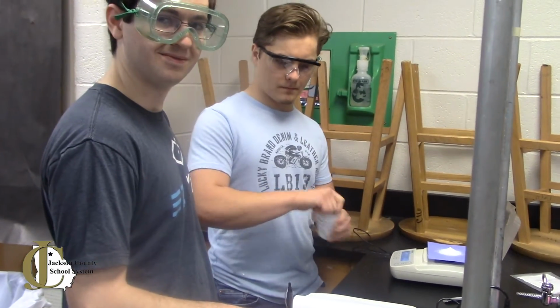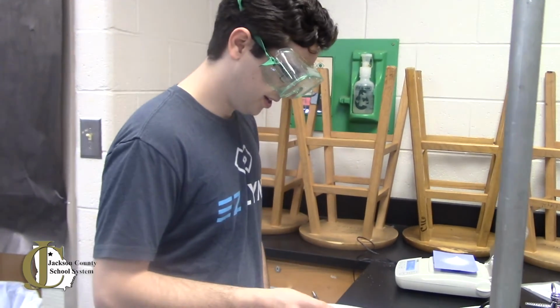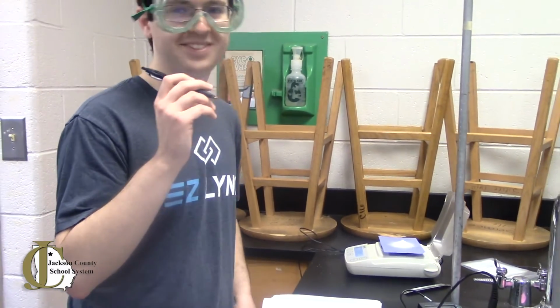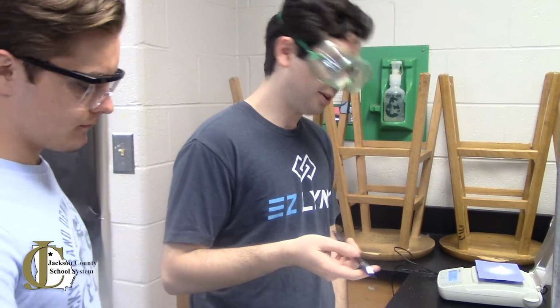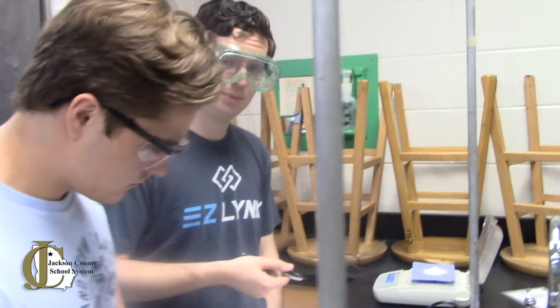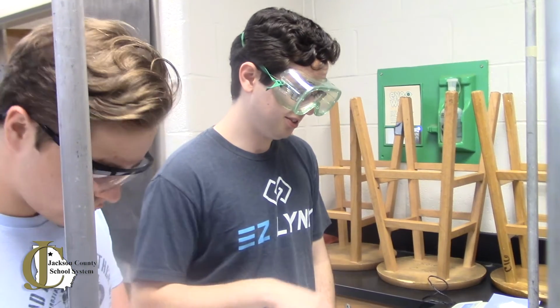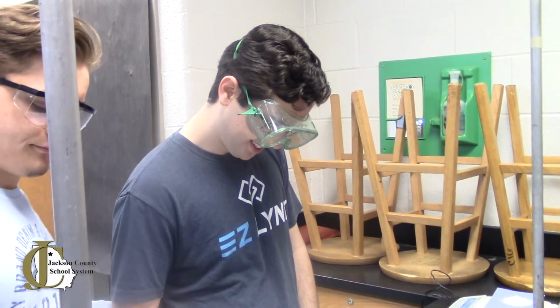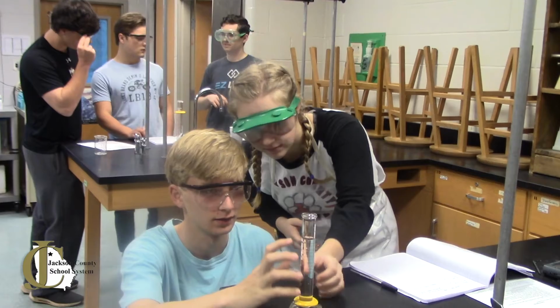Which chemical are you using? Currently we're using Na2S2O3, sodium thiosulfate. We're a bit surprised, as we expected the salt to be endothermic in the reaction, but it turns out to be exothermic. That's a surprise to us because we didn't expect it to turn out like this. We expected every single salt to make the water cooler, and this made it warmer. Yeah, beauty of science, I guess.